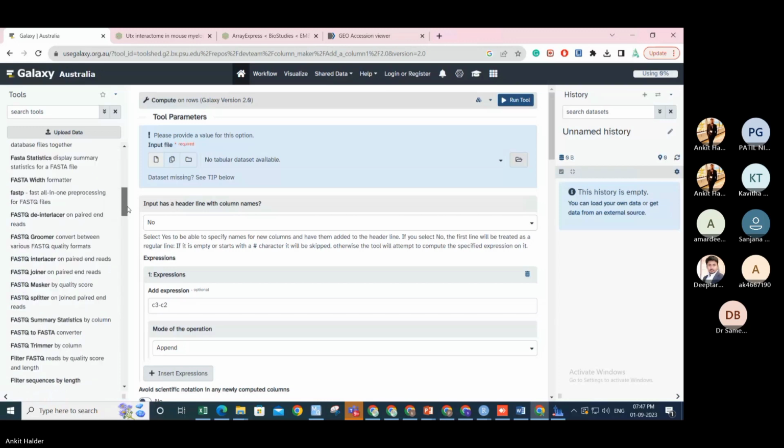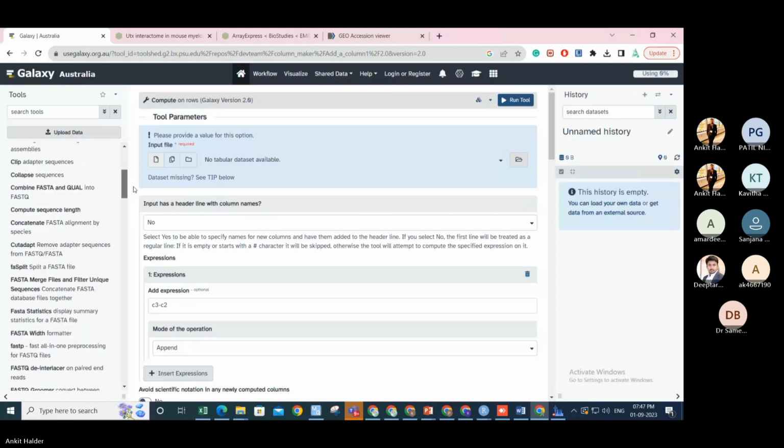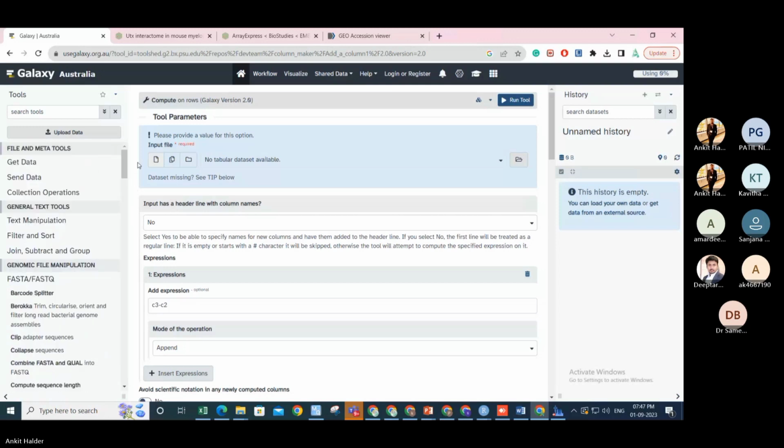Then you find out the quality check of those. So in the proteogenomics pipeline, this plays a huge role where you can find all your genomics data. You can analyze your genomics datasets followed by proteomics datasets by making the pipeline. But you have to understand that since it runs on a server, it will have some issue with time.